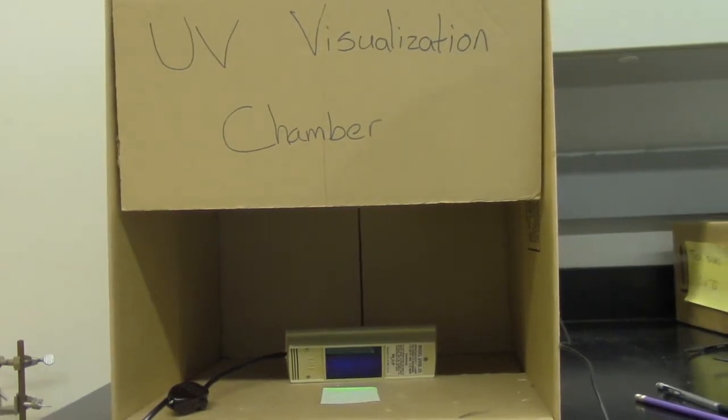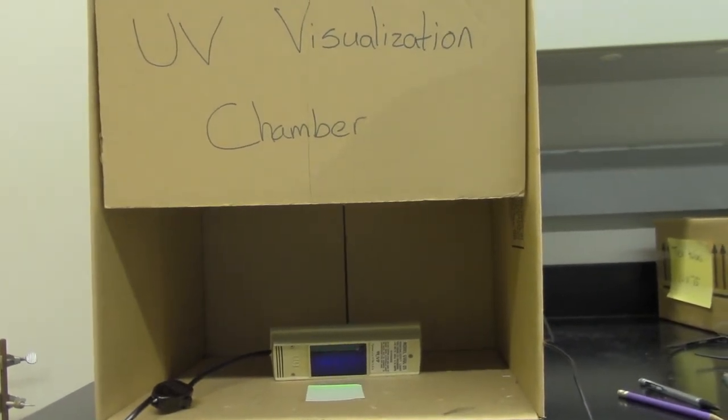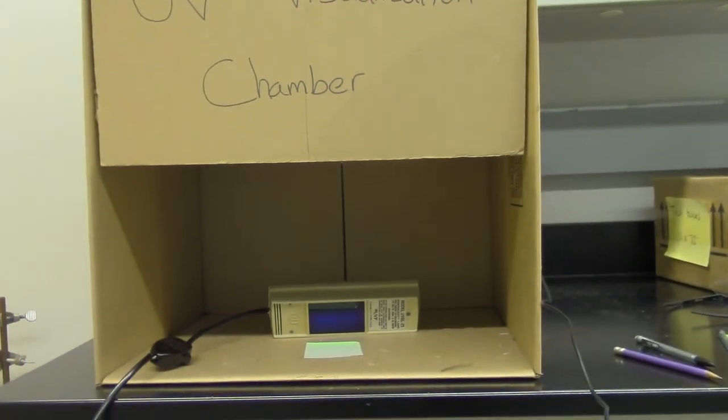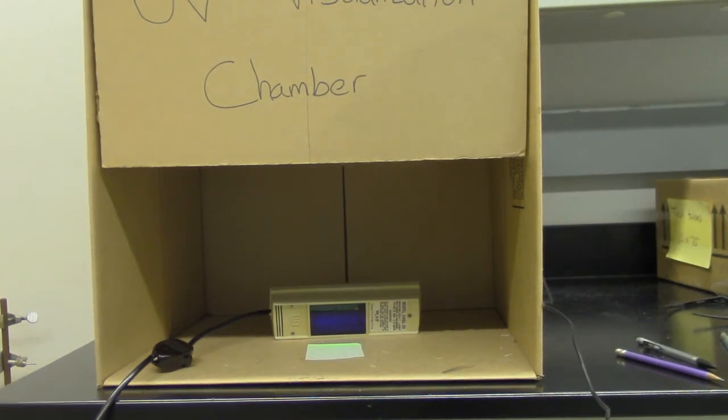So this is our in-house UV visualization chamber. I just made a cardboard box, right? And you will see a UV lamp in there with the TLC plate that we just developed. Okay, so I'm going to turn off the light so you can see the UV lamp better. Okay, so this is the TLC plate under UV light.